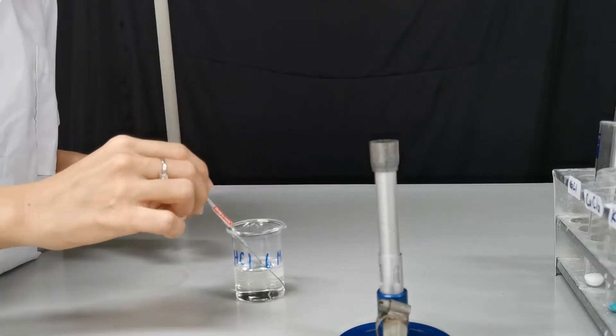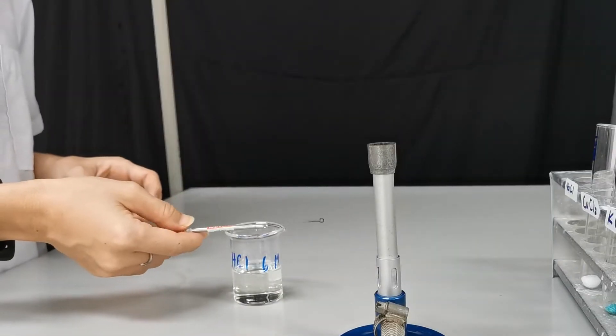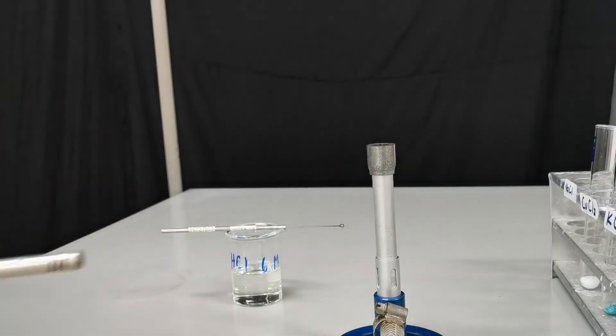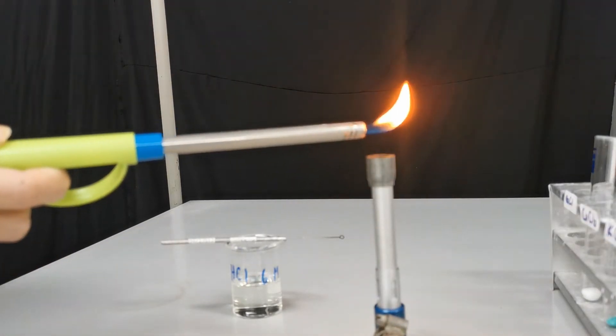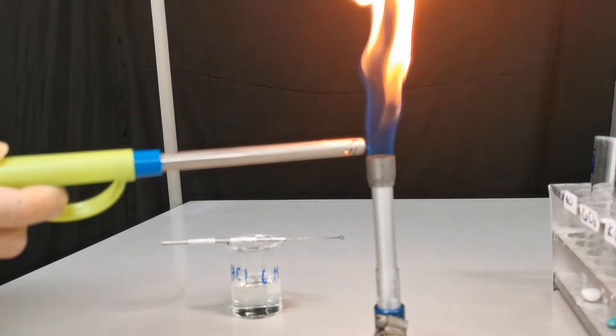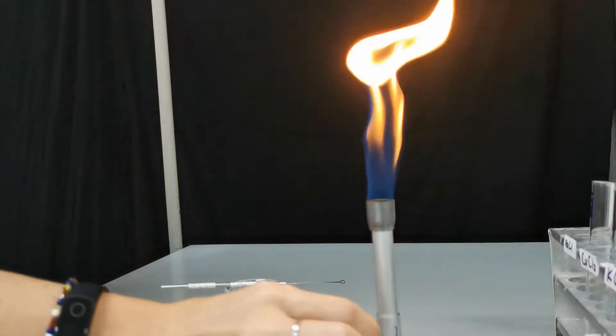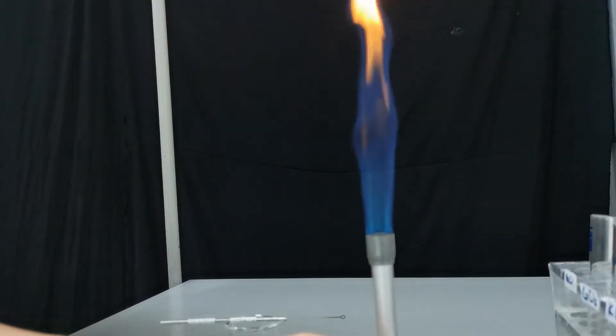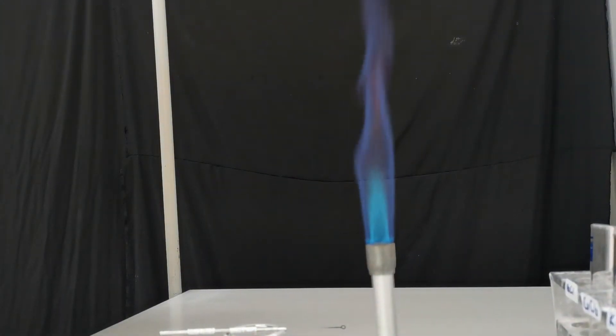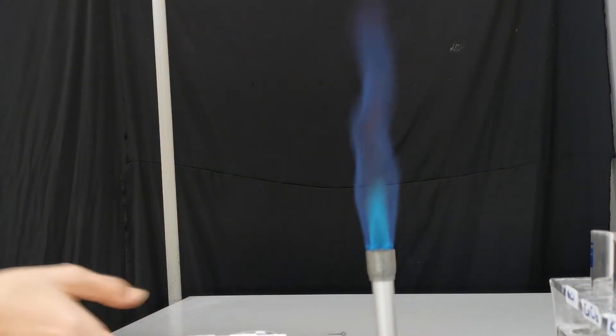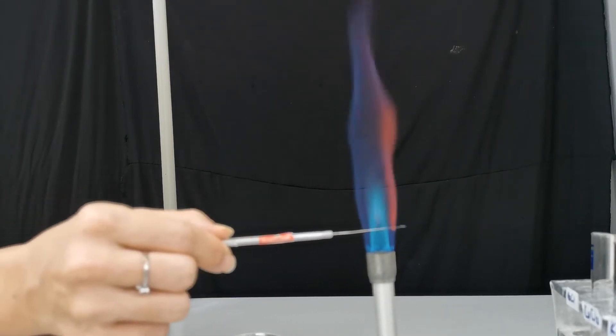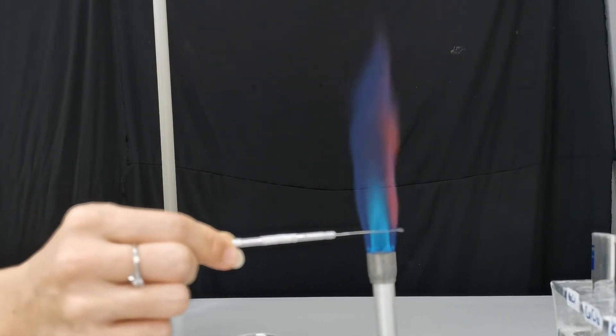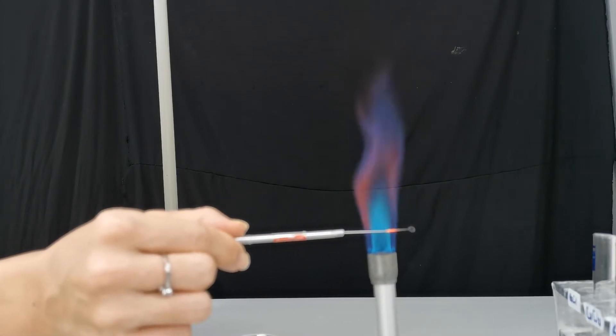After washing it with concentrated acid, then we can start the flame test. For flame tests we need a hot flame, so we need to maximize the oxygen flow in the Bunsen burner and get this blue flame. Before we start, we just burn the loop once again just to ensure that there is no impurities left over on the wire.